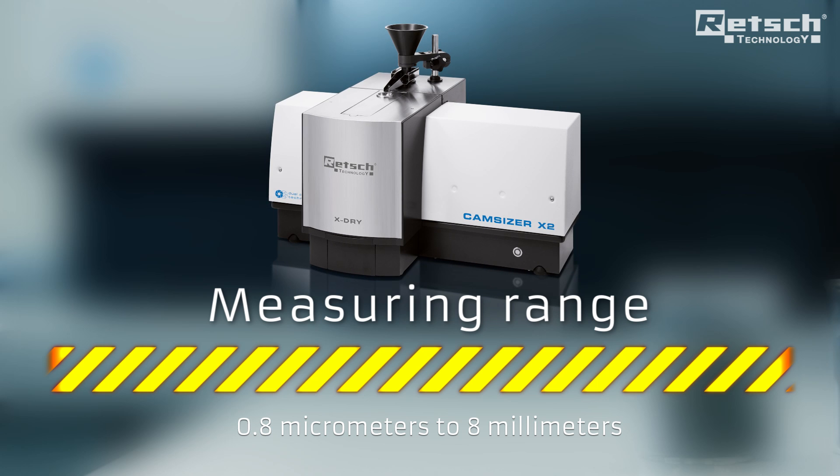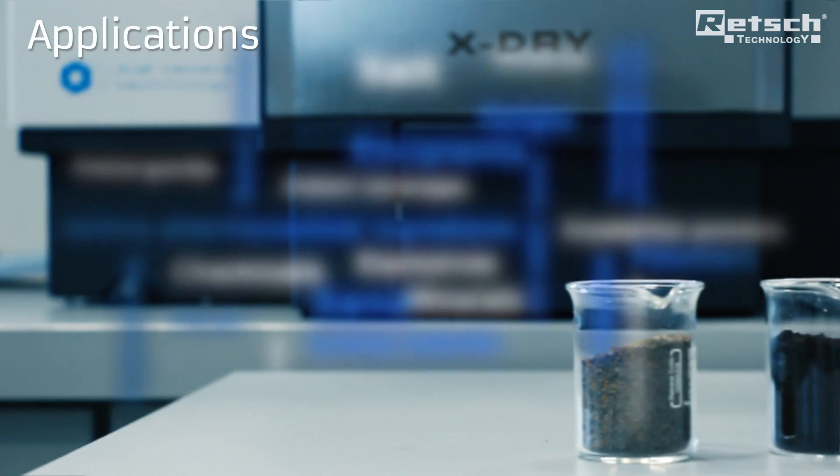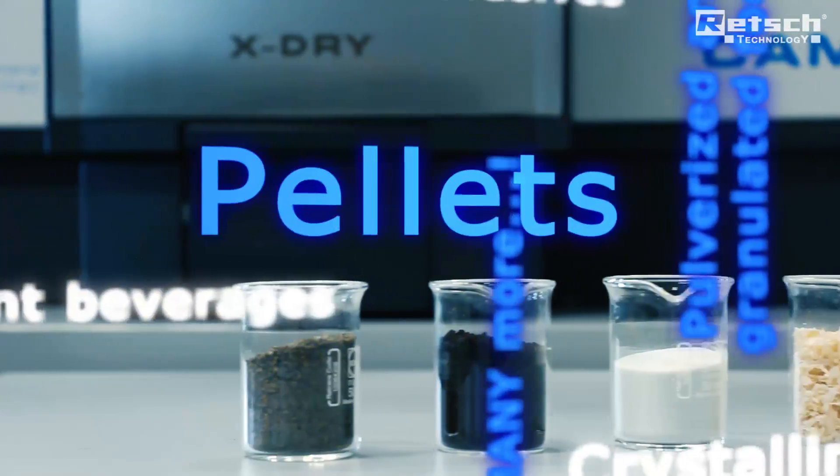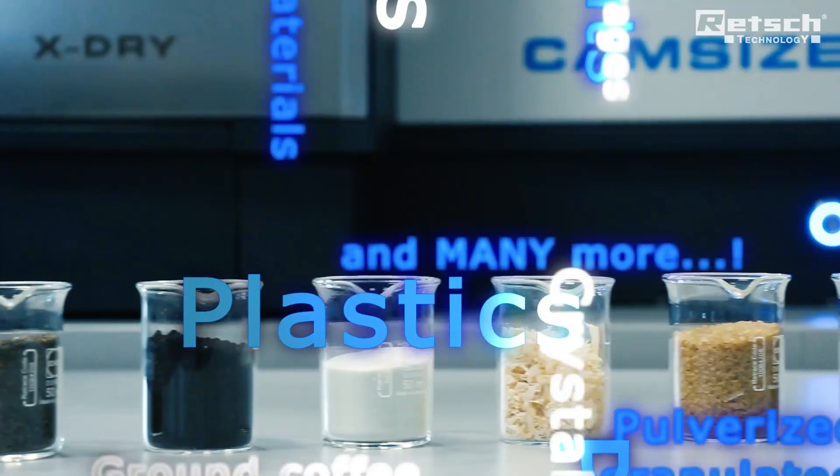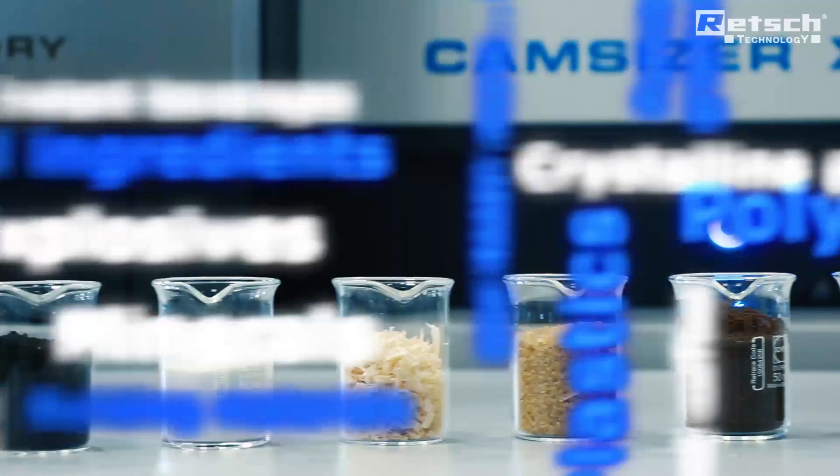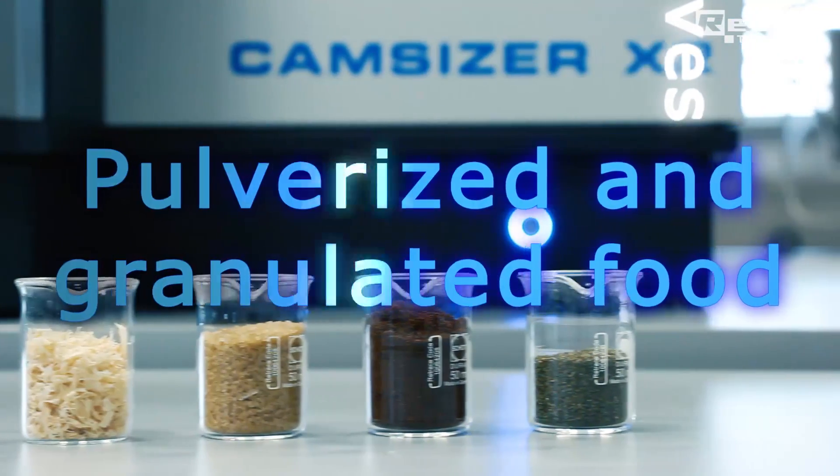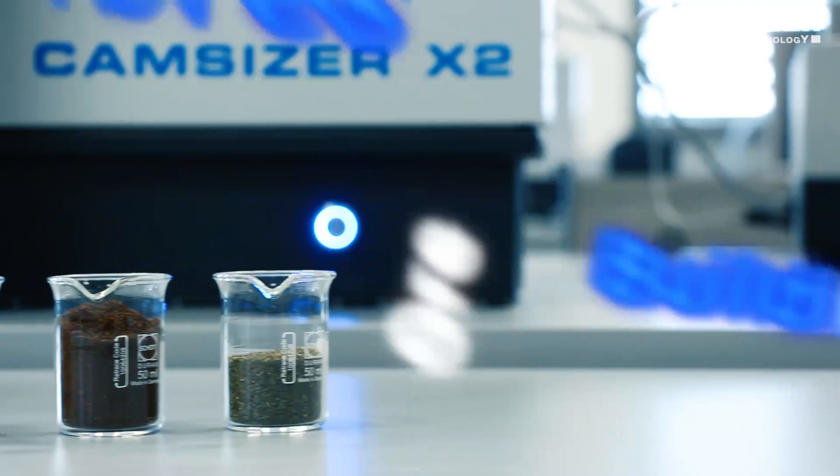This makes the CamSizer X2 excellently suited for measuring a great variety of samples such as active pharmaceutical ingredients as well as excipients and pellets, metal powders for powder metallurgy and laser sintering, plastics and polymers, sand and building materials, pulverized and granulated food, explosives, fibers, and many more.